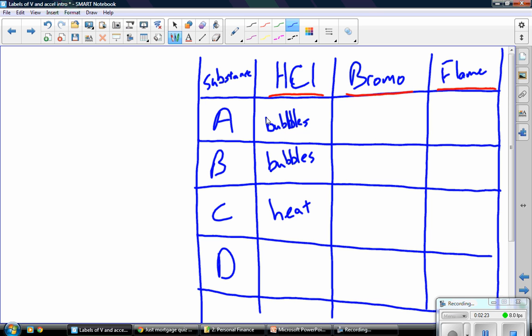But if there isn't that sustained bubbling that you saw with samples A and B, you probably shouldn't take that as being an indicator of a chemical change. It's more than likely just a little bit of air bubbles escaping. Now, if you want to avoid that, before you add a liquid, just give your sample a gentle shake, and that should help some of that air escape, okay?